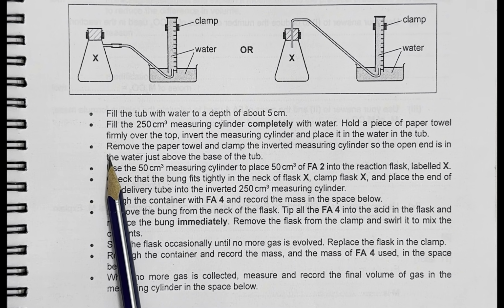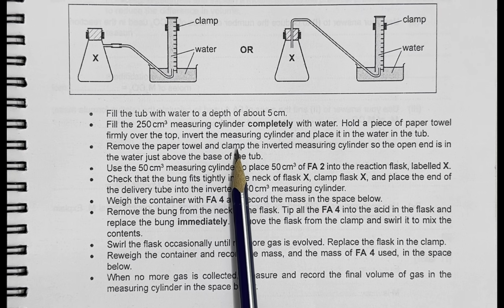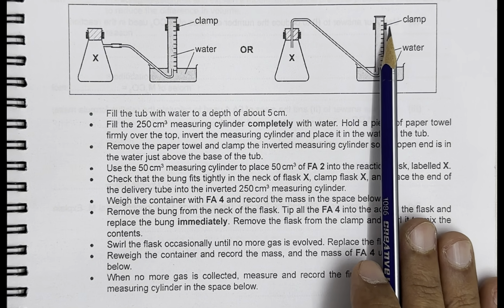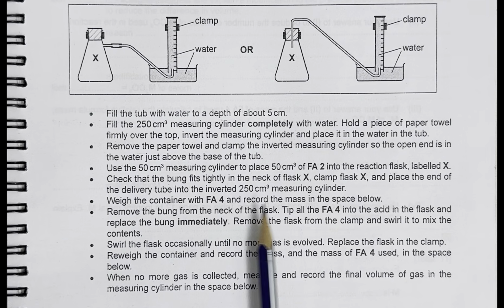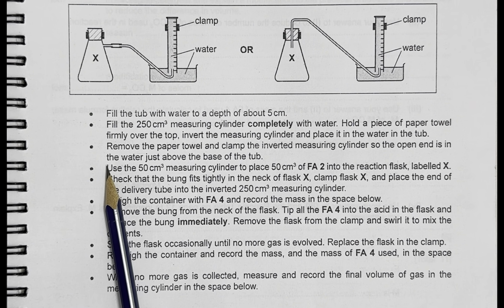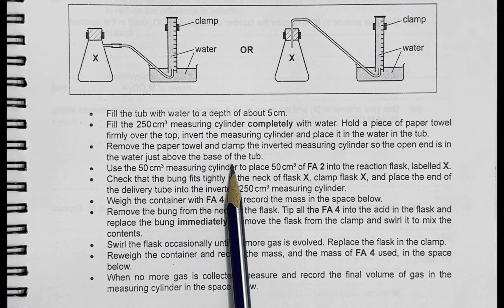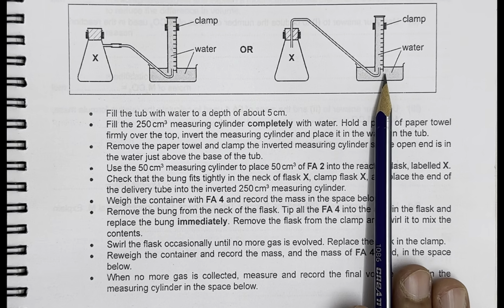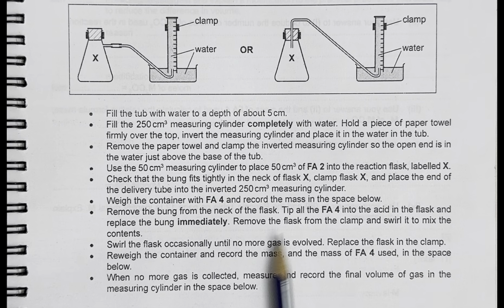Then remove the paper towel and clamp the inverted measuring cylinder. So here we can see the clamp is there. They have clamped it so that the open end is just above the base of the tub. So its base must not be closed. It must be suspended a bit higher from the base.